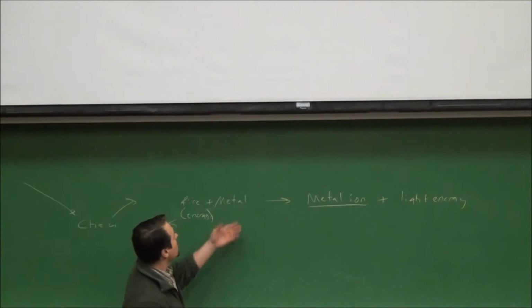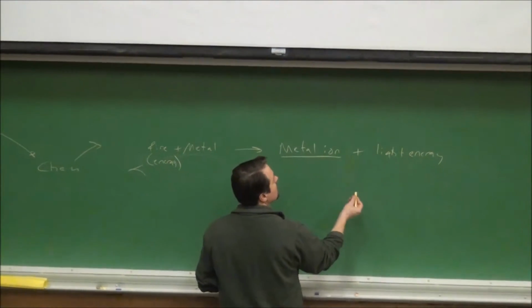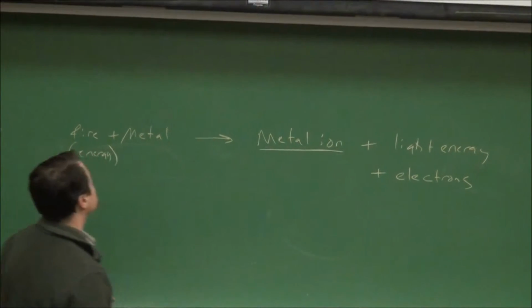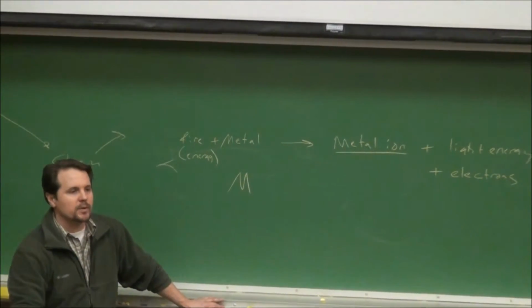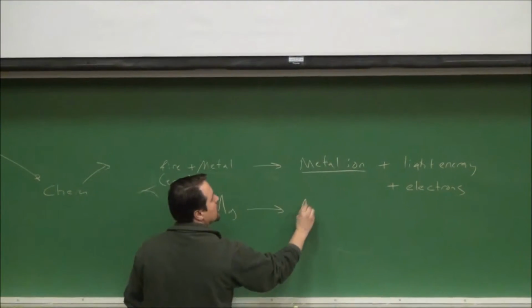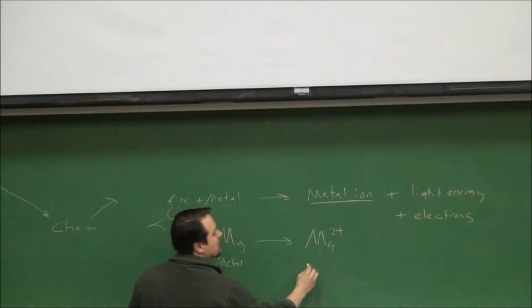And you'll see this. We're going to use different metals. When the metal ion loses its electrons, some electrons leave. Symbolically, remember the strip we burned that burned really bright? That was that one demo. We took magnesium and heated it up, and we created magnesium 2+. This was the metal, and then we had the metal ion.